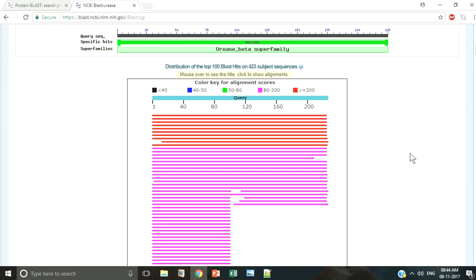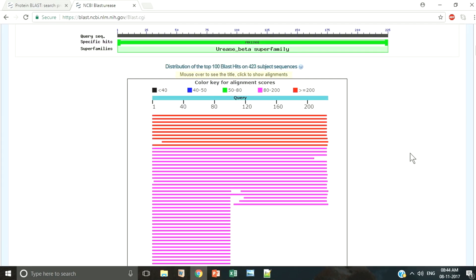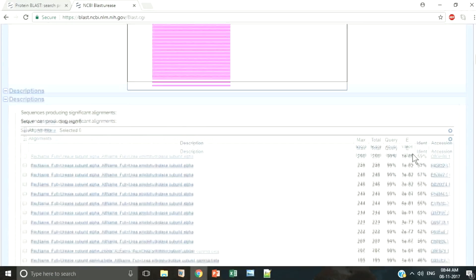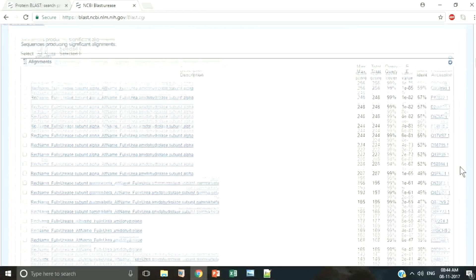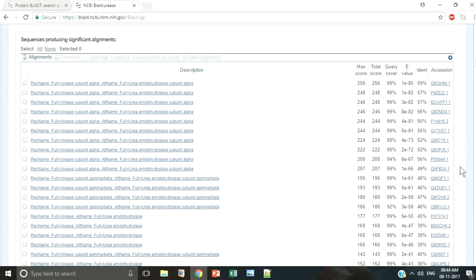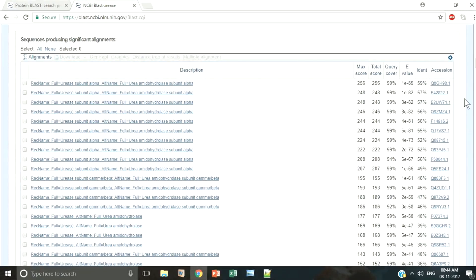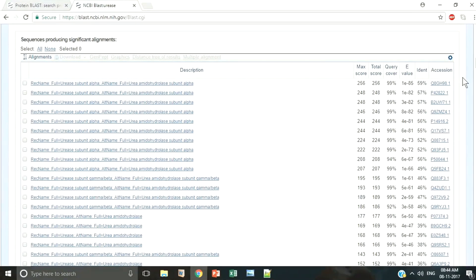The color of the boxes correspond to the scores of the alignment. Scrolling further down, we find a summary table that shows all the sequences in the database that show significant homology to the query sequence. By default, the results are sorted according to the increasing order of the E value.